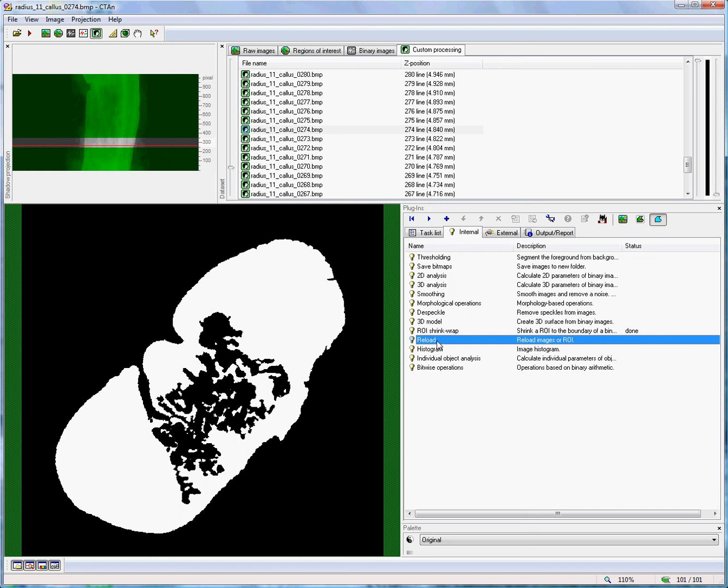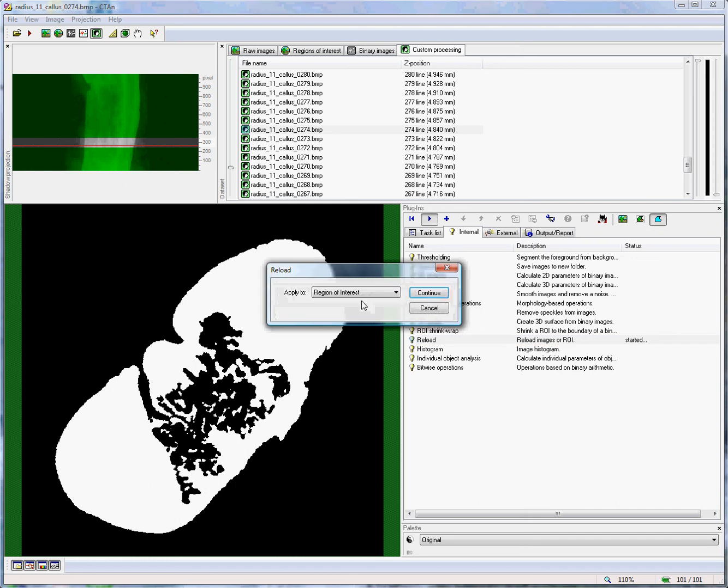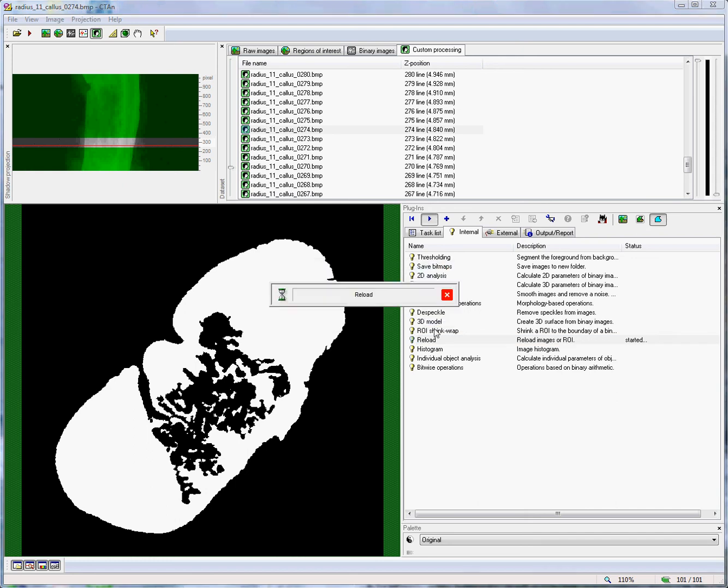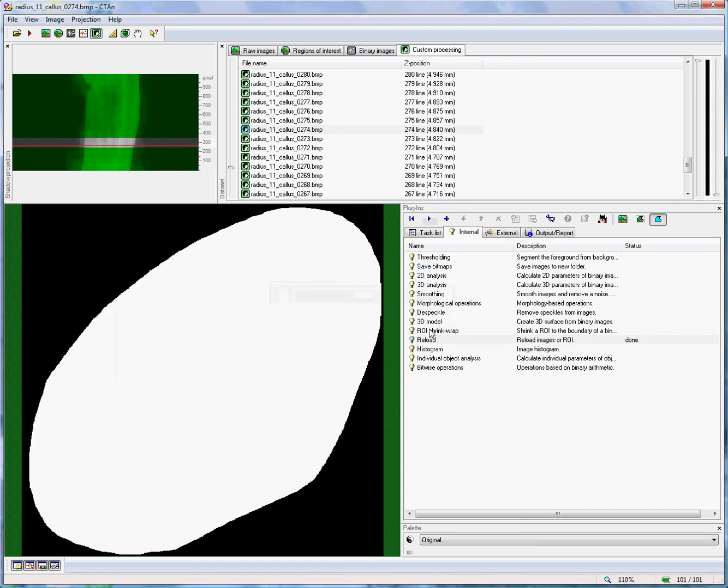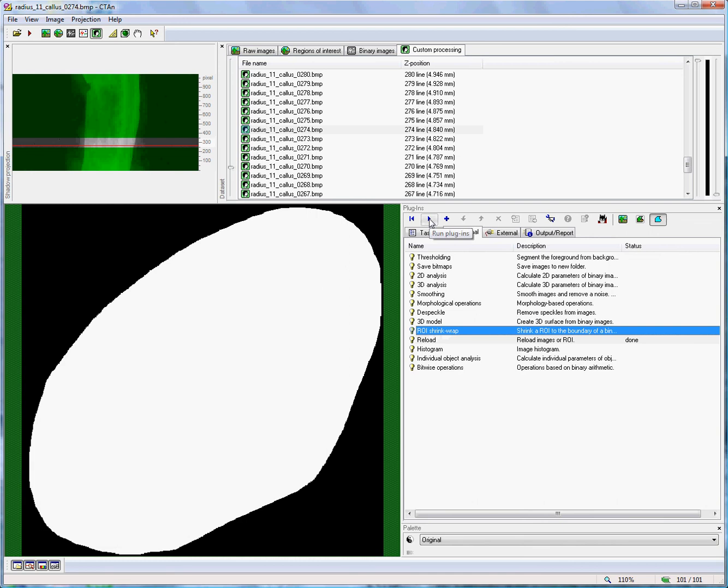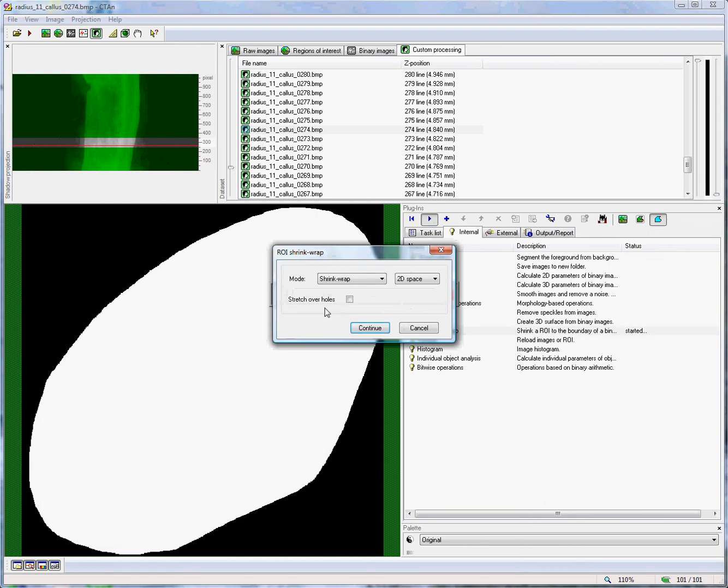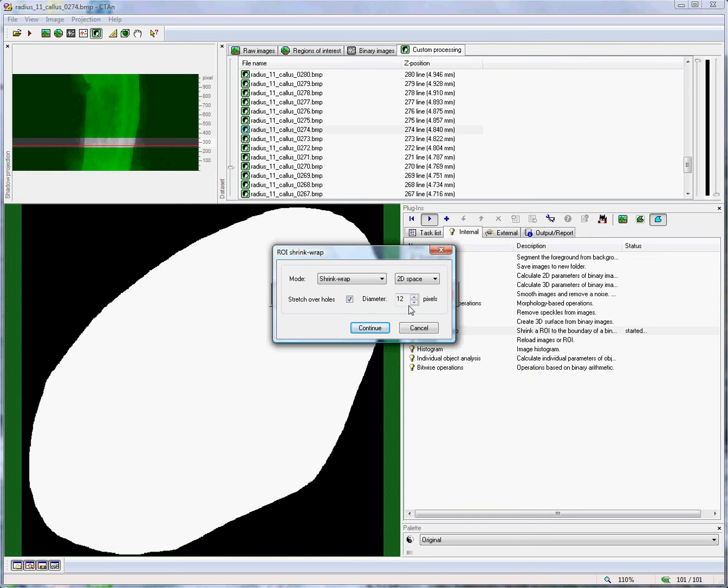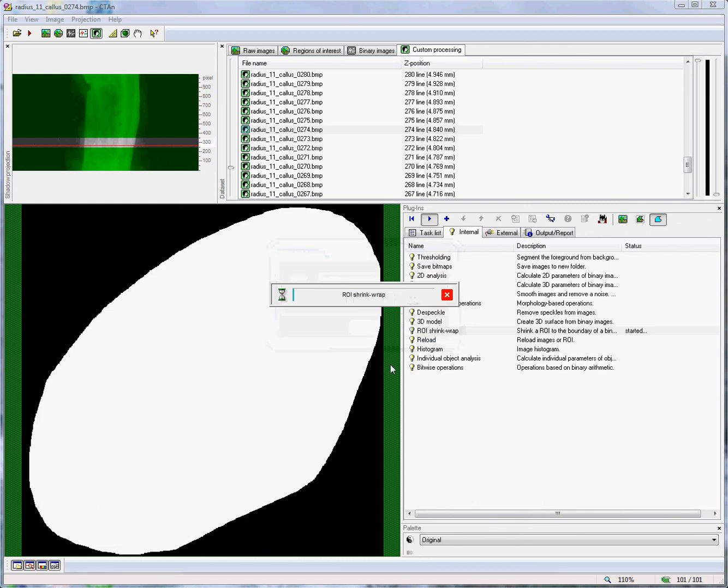At this point, I will run the reload plug-in and reload the original region of interest back in. And let's try that again. This time, we will run the ROI shrink wrap plug-in, but we will activate this sub-function, stretch over holes. And we will choose a diameter sufficient to fill in the holes that we do not want to be included in the ROI. So I will choose, for example, a diameter of 16 pixels and continue.